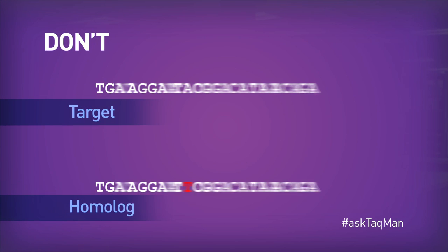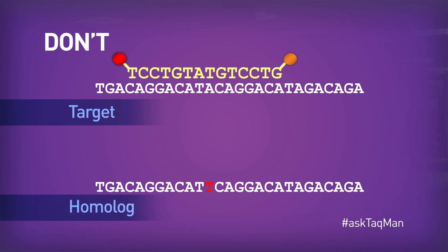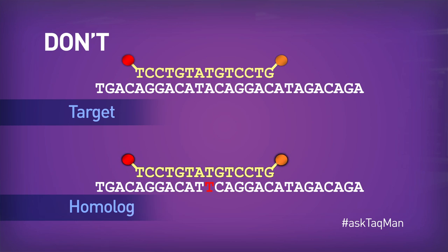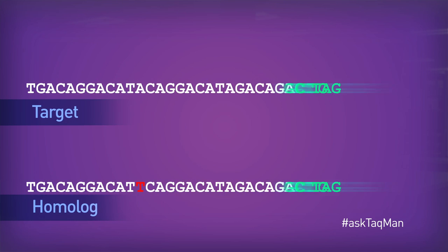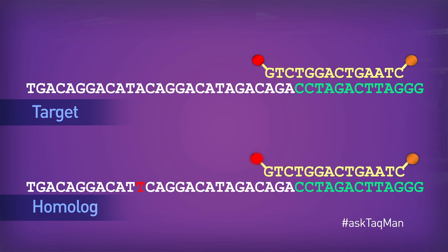Third, be careful about designing to sequences that aren't unique. Be especially mindful of homologues, which often differ very little from the sequence of interest and might therefore cause erroneous signal. Try to always design at least one oligo to a region that's unique enough so that your assay won't give unwanted signal.